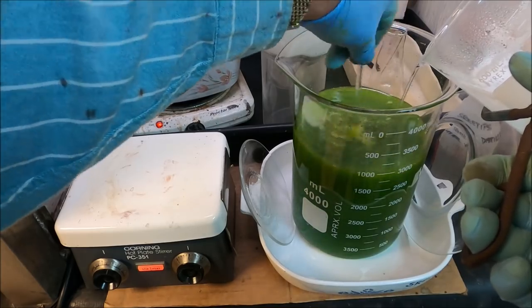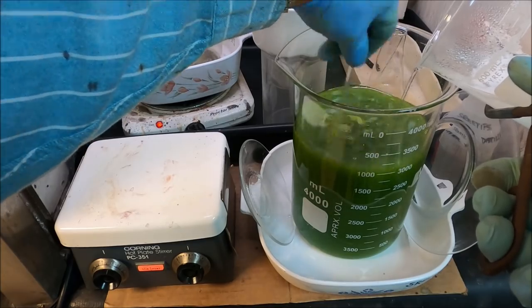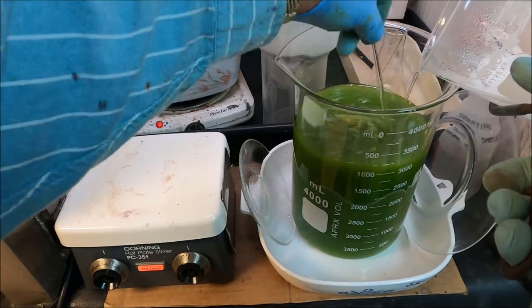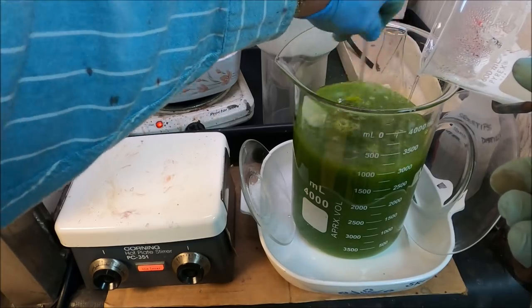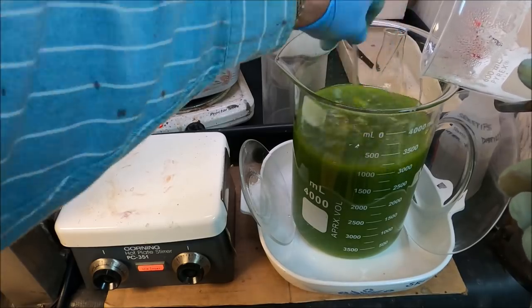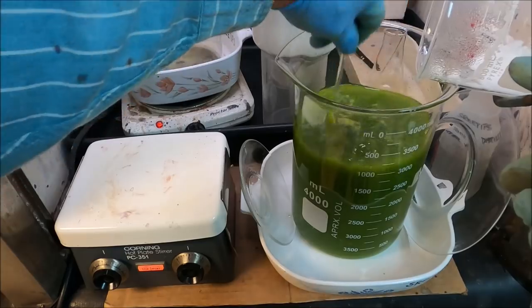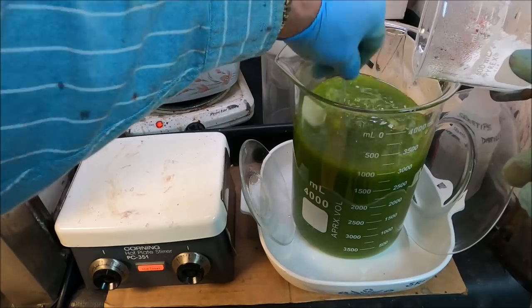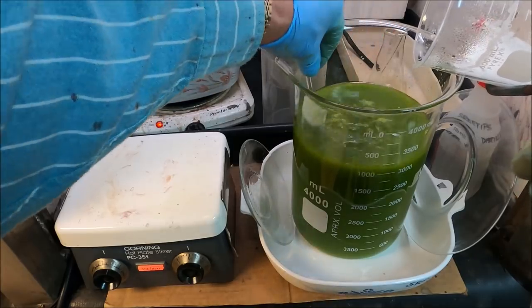If you remember from our last experiment with this, after the platinum group metals come out of solution with the DMG, if we let this set, then the gold will come out of solution also, contaminate our platinum group metals. So we'll want to get this off of here and get this filtered out of here pretty quickly after we get this done, so that the gold doesn't begin to come out of solution and contaminate our palladium salt here. Of course, it takes overnight. It had to sit overnight for that to happen. So it's not all that urgent.